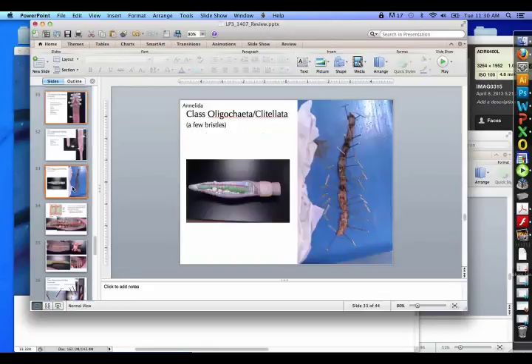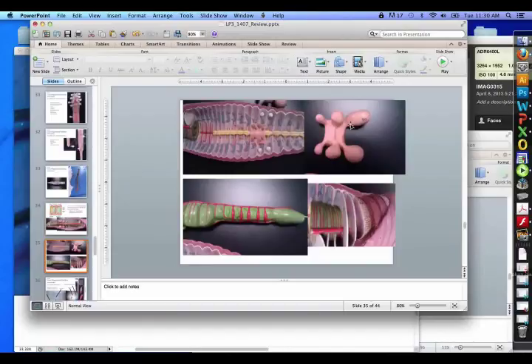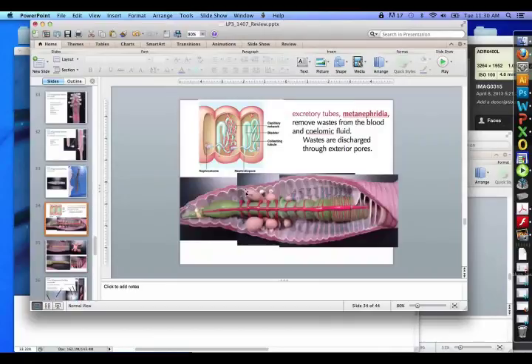And we can see those on the model. So these are seminal vesicles. Those are our little seminal receptacles. It's external fertilization still, so they just release the eggs and sperm. I think of them as receptacles because typically the female receives the sperm. It's not internal, but that's how I remember it. The male actually produces that and excretes it. Both of them do that here, but the little ones are female, the big ones are male. Vesicles, receptacles, vesicles.